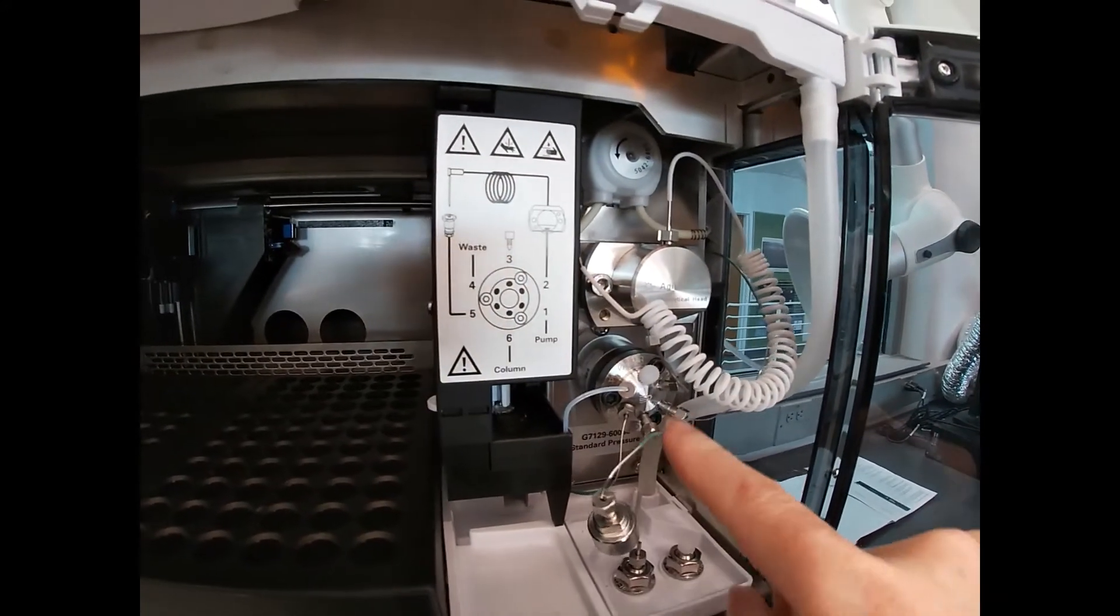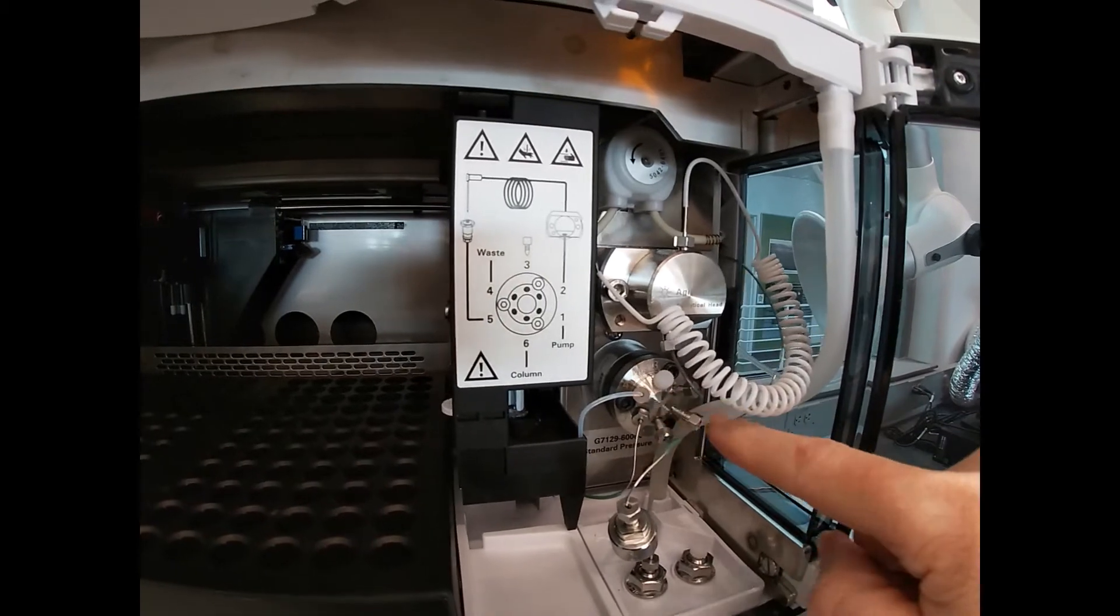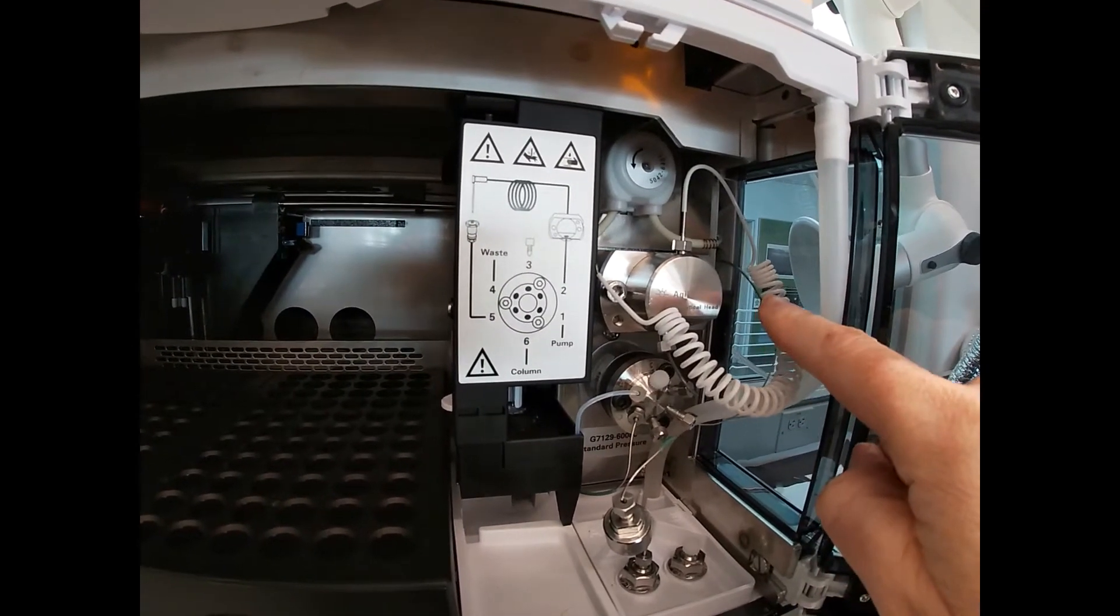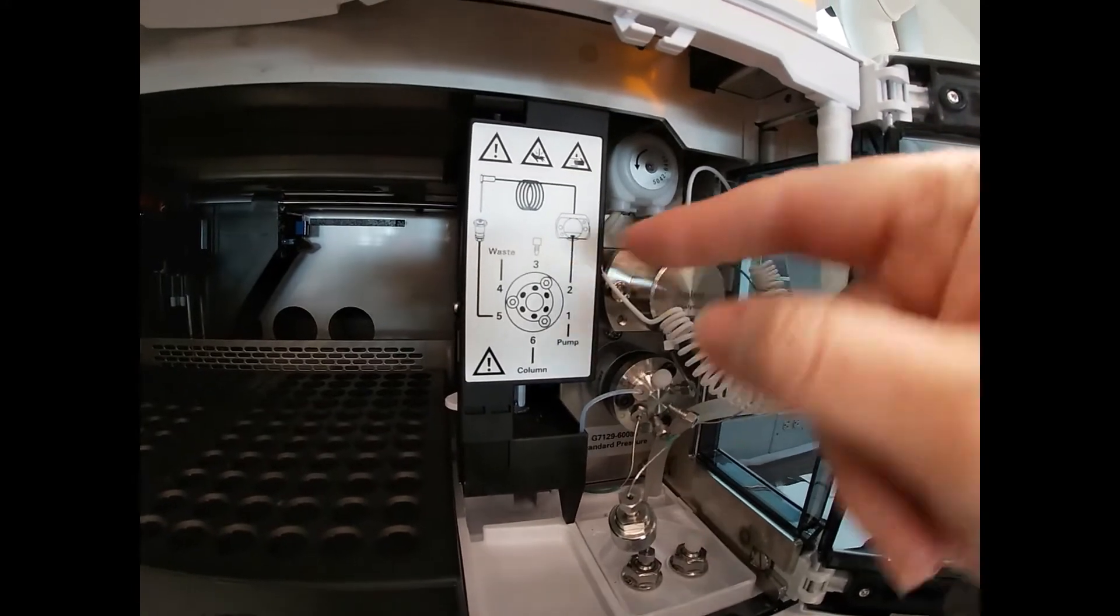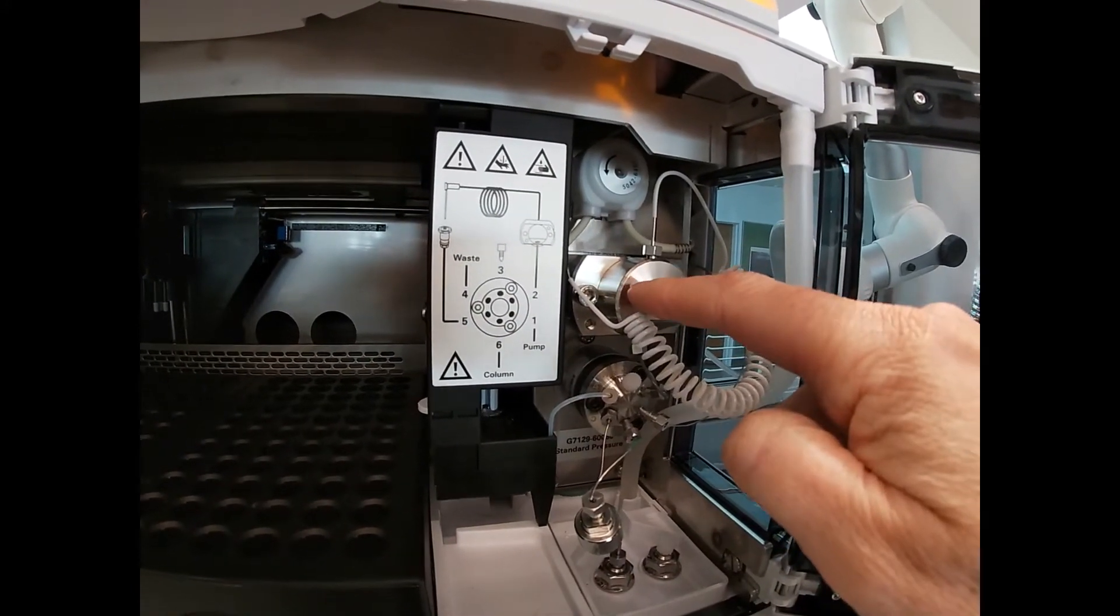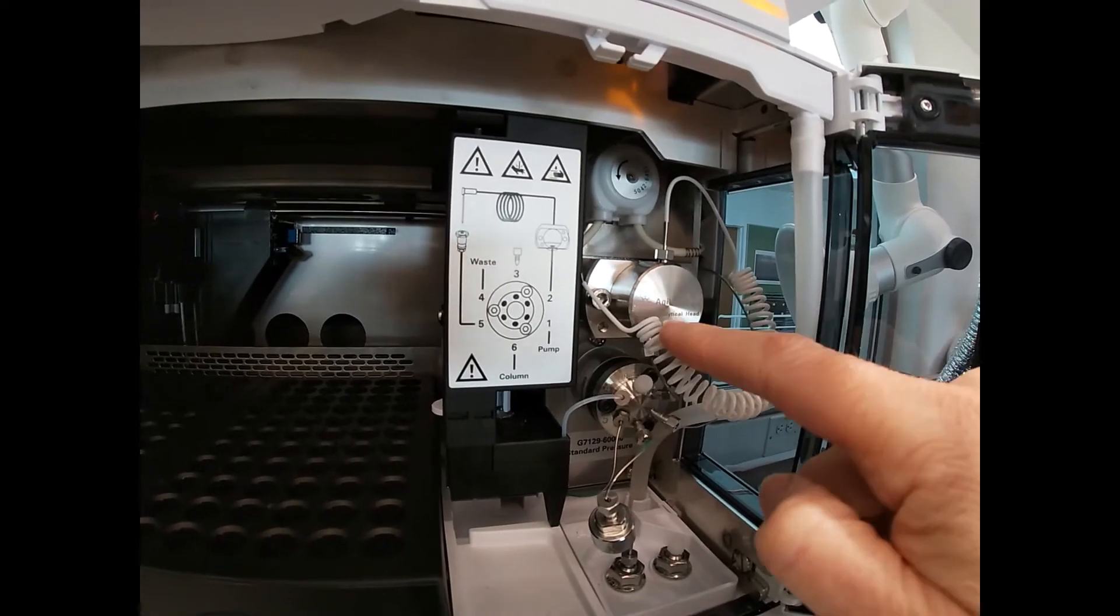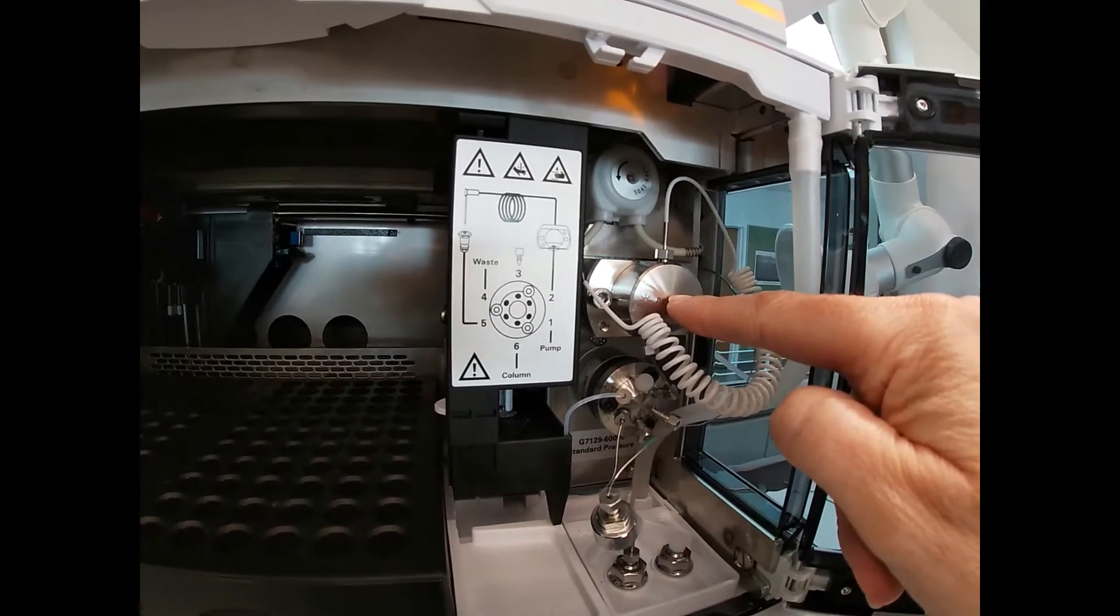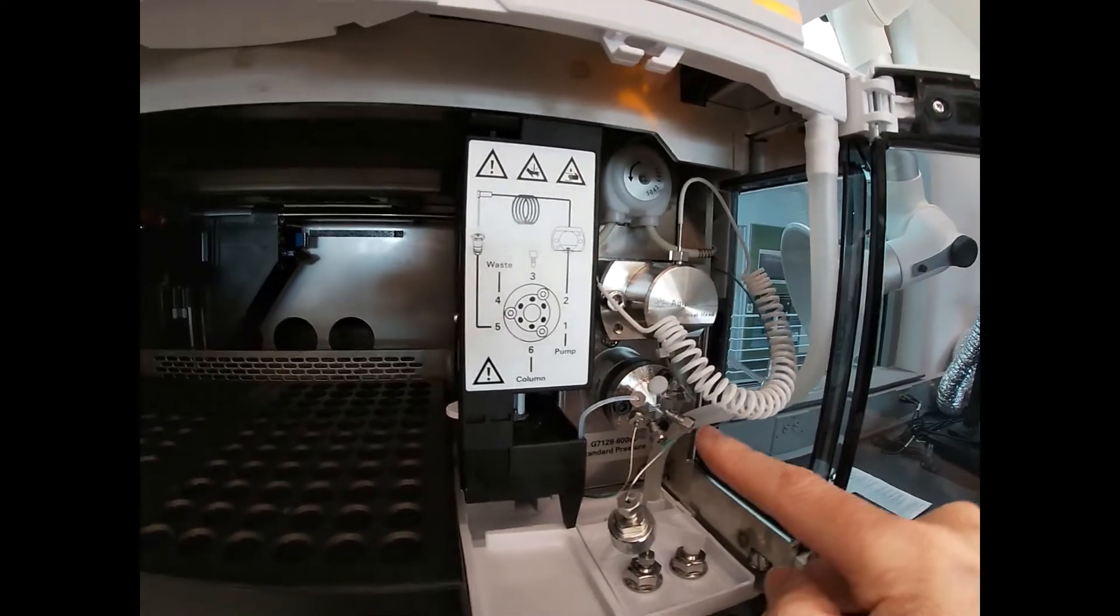The sample is flowing through—we have eluent that flows through—and when we're ready and we've filled our loop, this switches over so that we connect our pump line and our loop line, and it pushes everything out of the loop onto the column or into our flow line.